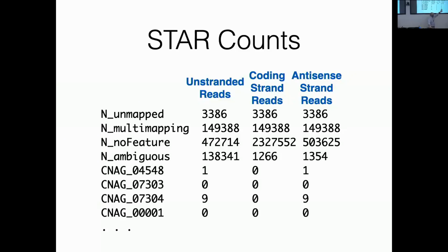The other group of methods generate the antisense, or reverse complement, of what you see in the genome. So if you see a sequence, it's going to map on the opposite strand from what you expect, the minus strand for that gene.